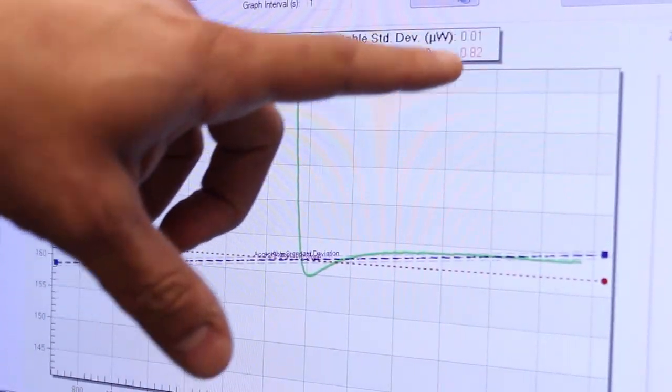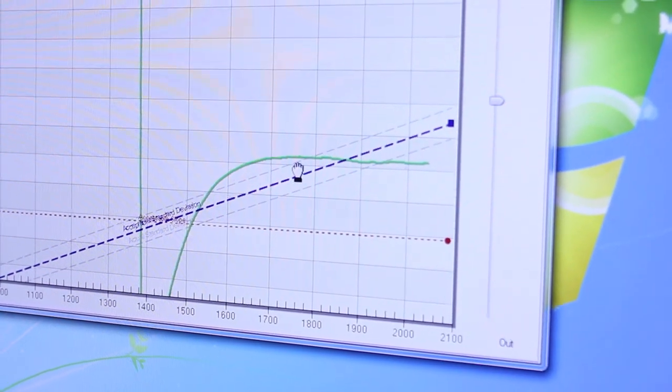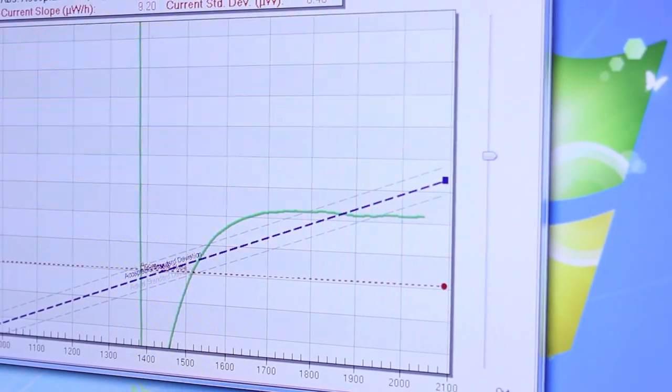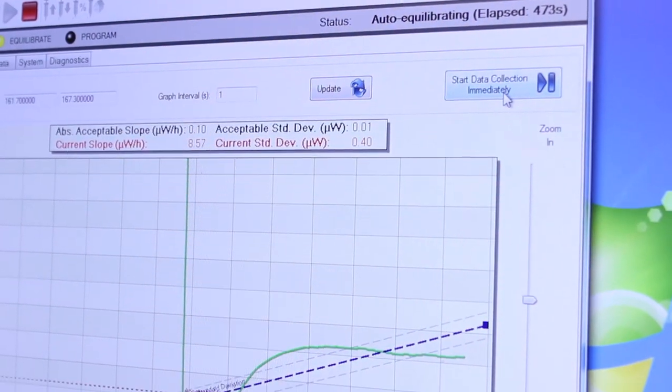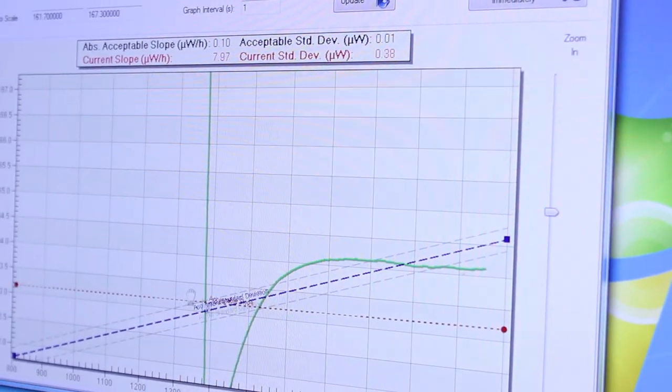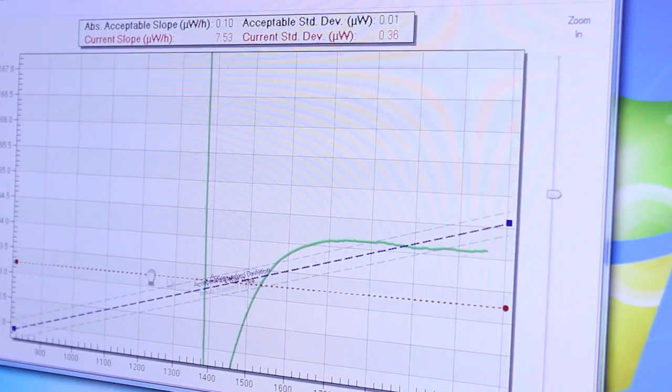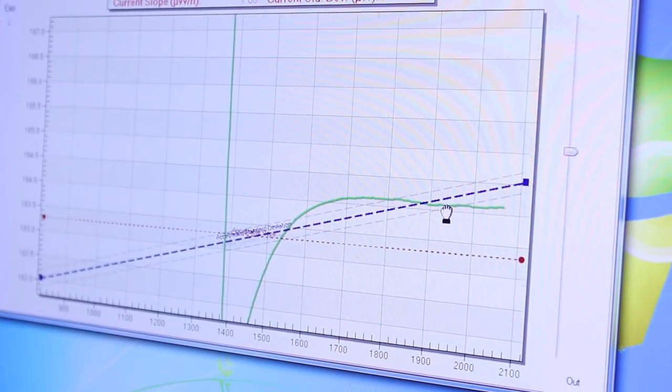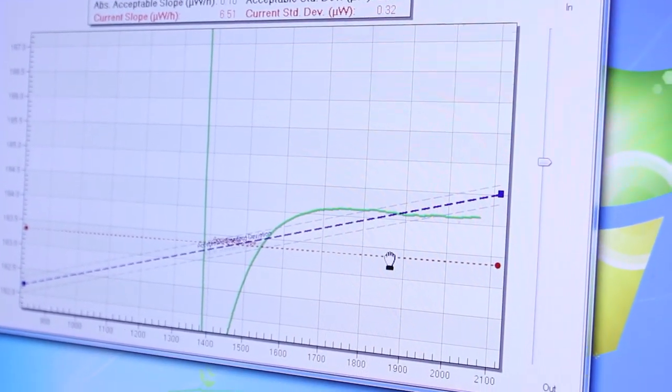Likewise with the standard deviation if at any point you want to override the auto equilibration you can always do so by clicking on the start data collection immediately otherwise you can just wait for the auto equilibration to proceed normally and when the baselines actual observed slope and deviation become within the acceptable ranges the experiment will automatically start.